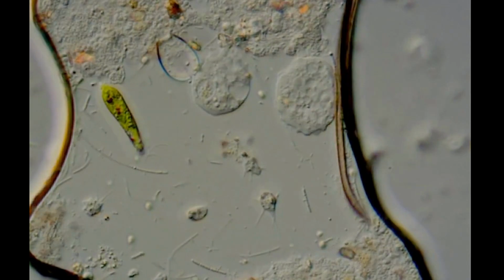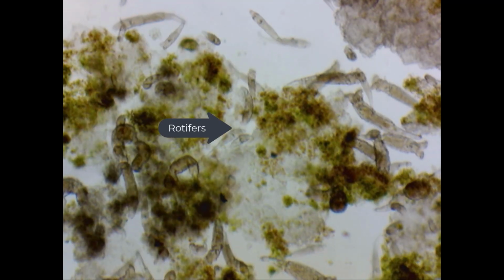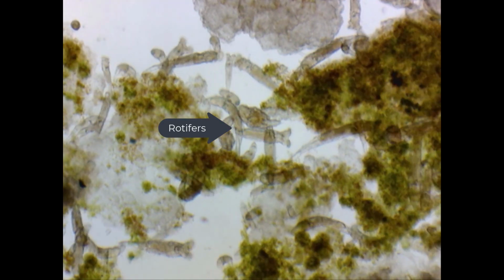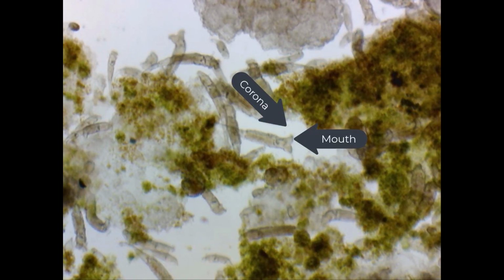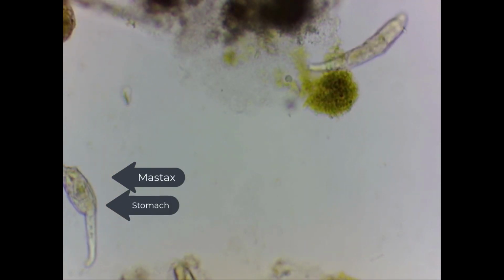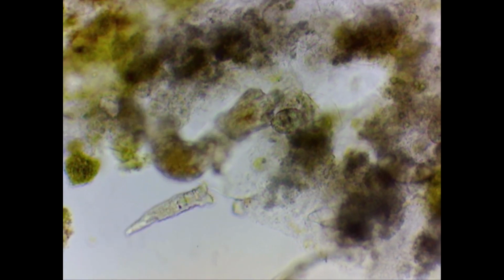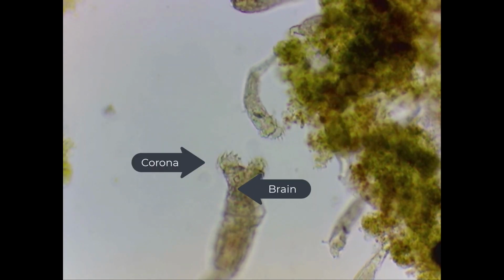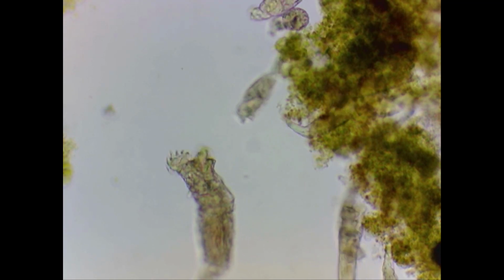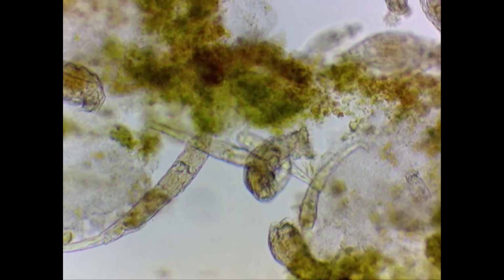The next sample, this sample was actually from a bird bath I have, and it's always notorious to have lots of rotifers in there. And you can see rotifers, you can see they're multicellular organisms. They have a corona with cilia where they wiggle around and try to feed on bacteria and other small organisms all the time. They're really cute to watch. And also EPA indicator organisms. When you look for toxicity, these organisms are used to determine if some environmental samples are toxic or not.